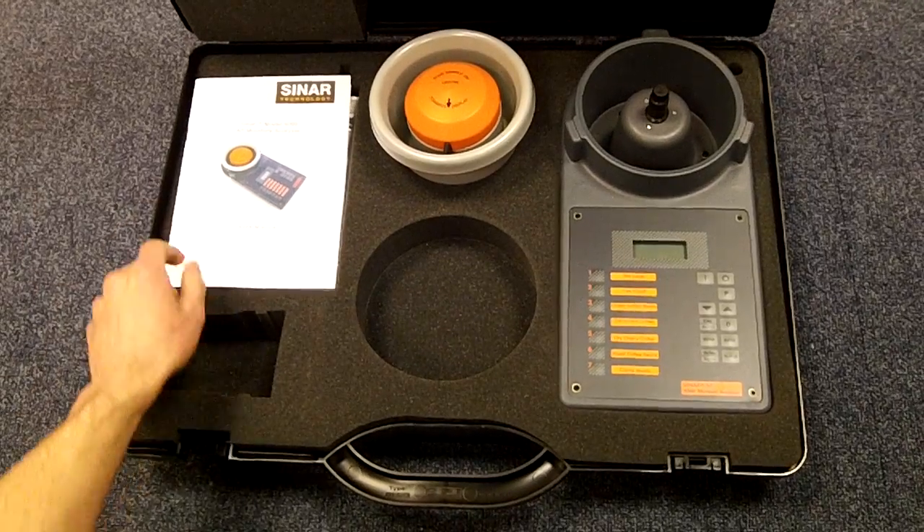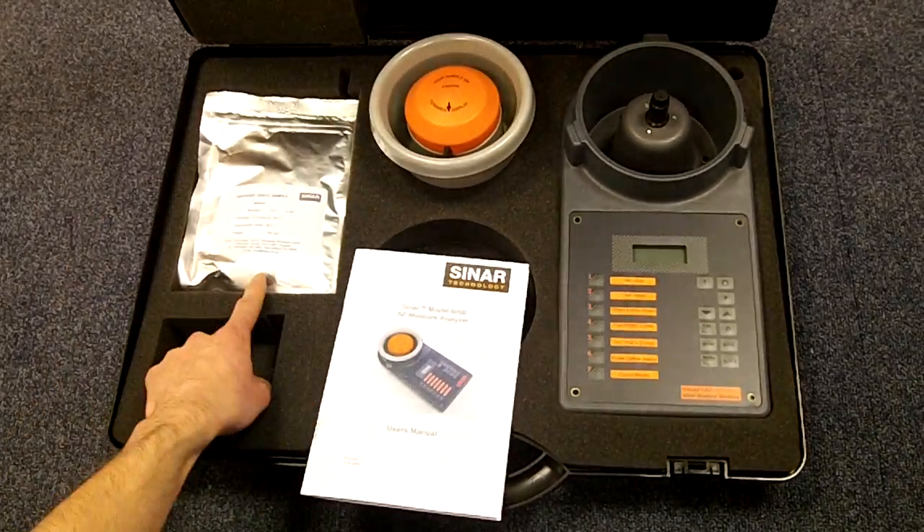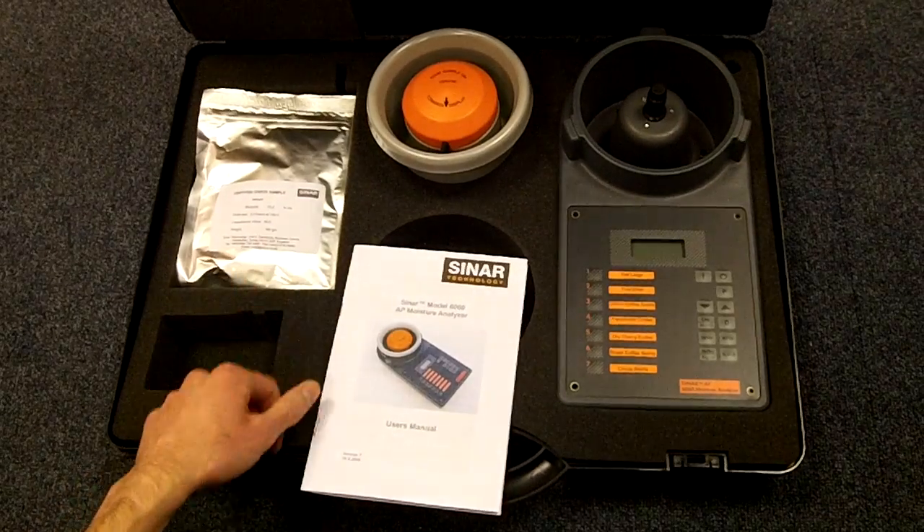You also have a user manual and a calibration sample for checking that the instrument is working properly when it arrives.